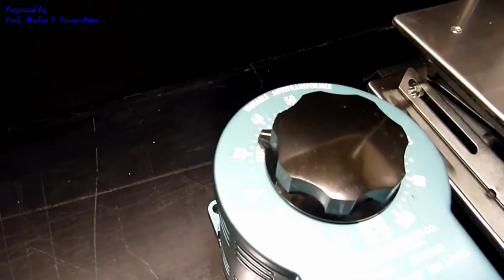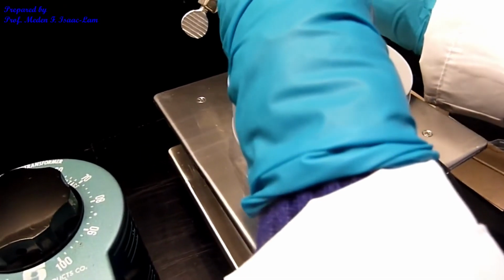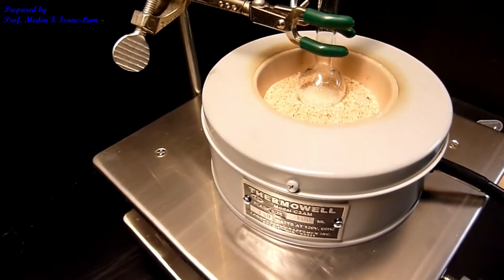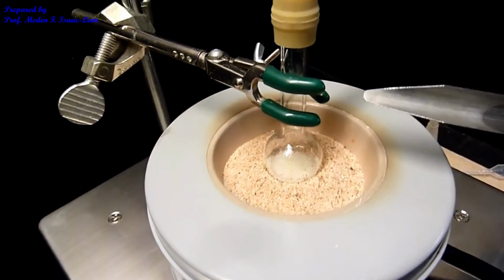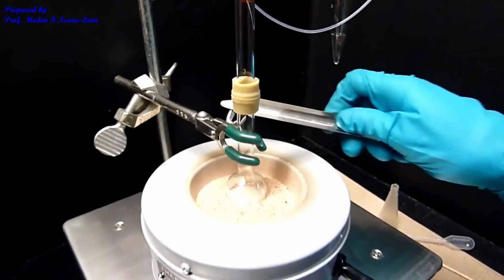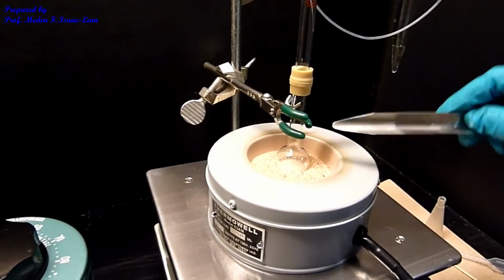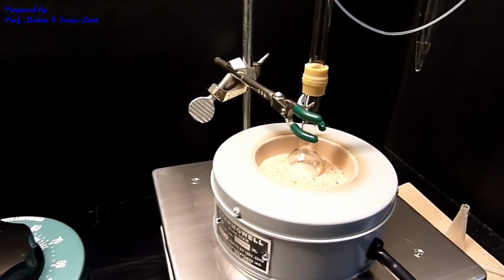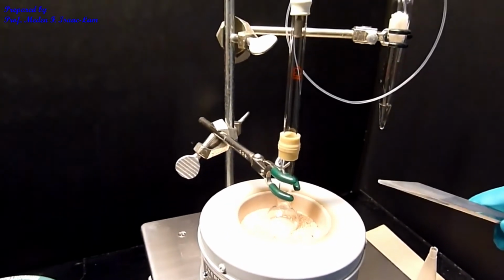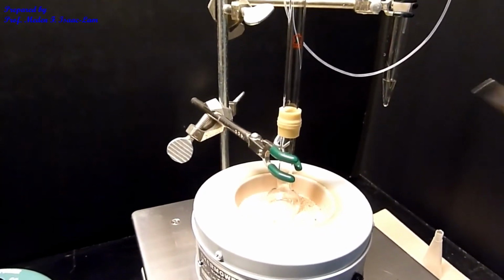So I want to see this refluxing. So I'm going to lower it a little bit more. So I don't want the bubbles to be going up so high. So I can raise it higher. So that's why I have it in a jack. Or I can also raise the clamp up if it's too much into the sand. So this is our setup. Once it starts to bubble and reflux, we are going to time it for 40 minutes for the bromination reaction to go.